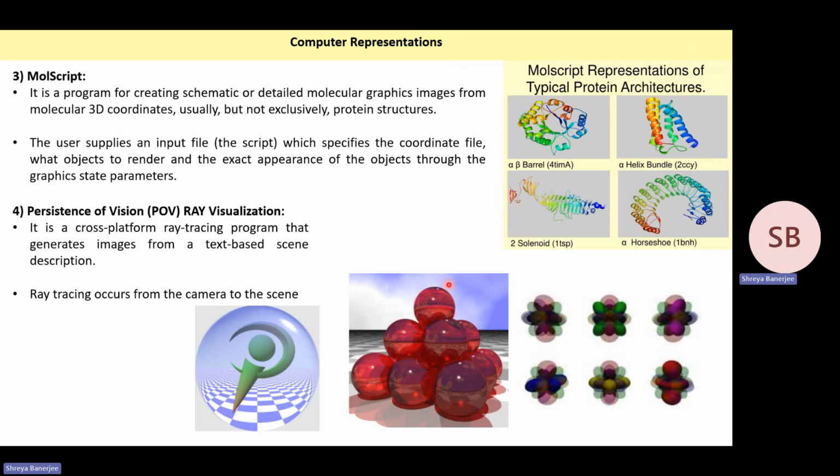So it will say that from one angle, the balls look like this. From another angle, they look like this, and so on. So the camera will trace the outline of the balls and give a three-dimensional view of the balls from different angles. And using that description that the camera has obtained, the computer will generate the images.